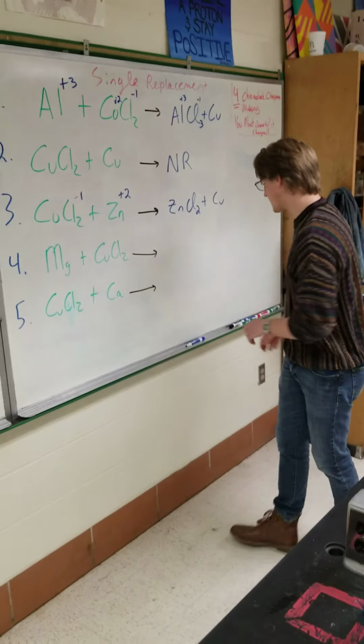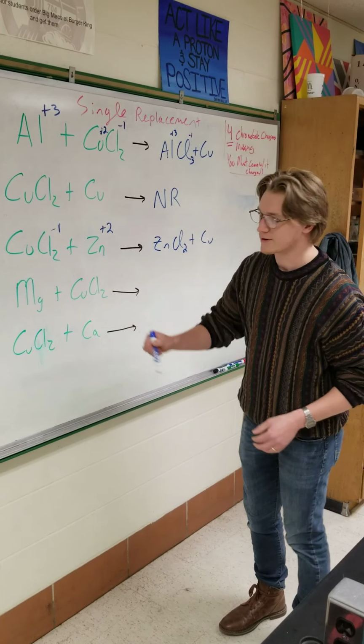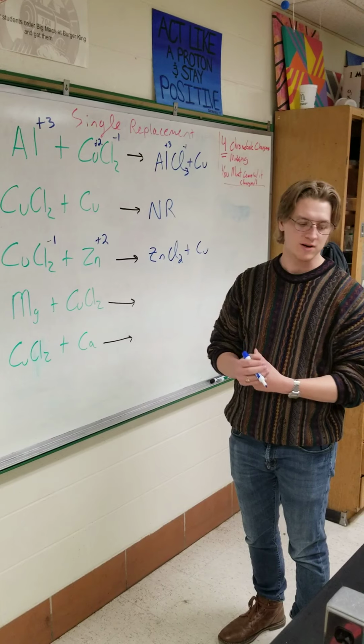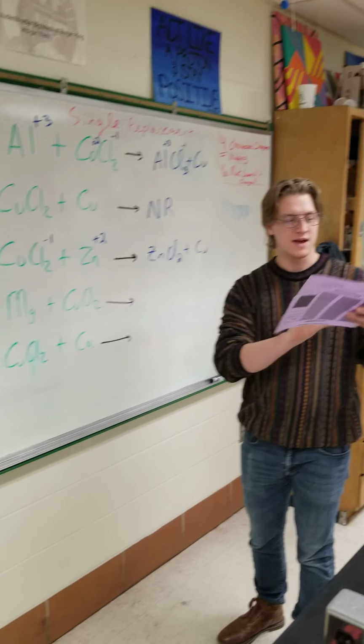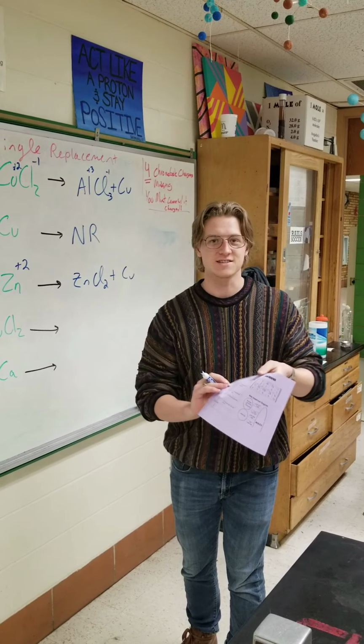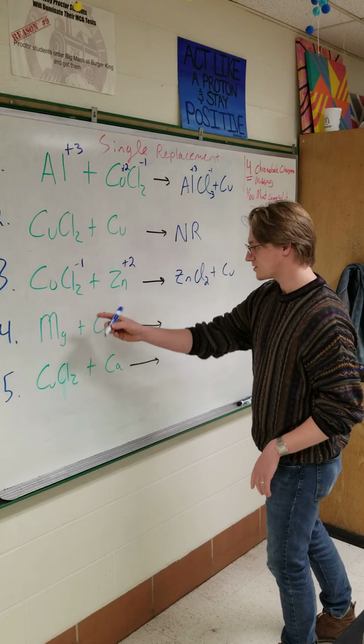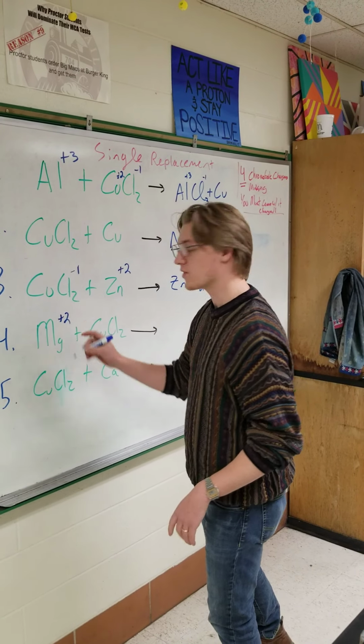Okay, so that's magnesium. Clearly that one works, and you're not always going to be able to test all these on your ChemQuest to see if they're going to work. That's why we're going to keep going back to the activity series. If you lost this sheet, it is linked on this week's page. So magnesium has a +2 charge. You know that from the periodic table.